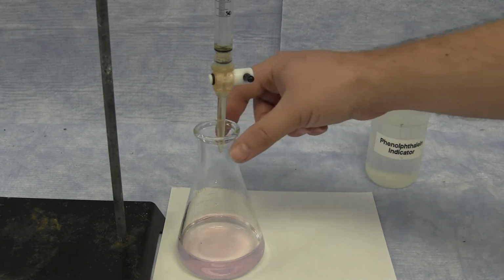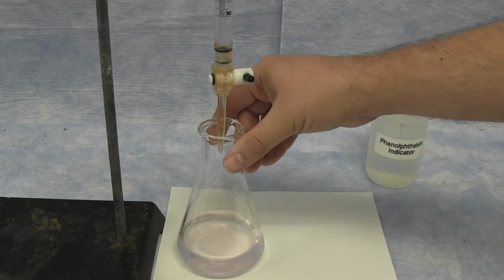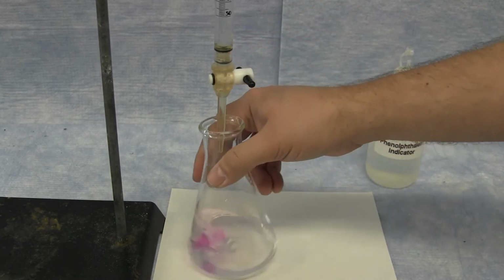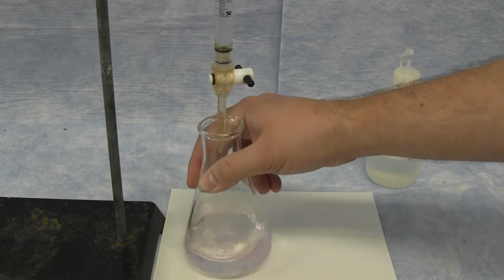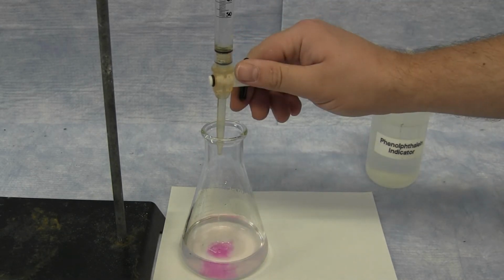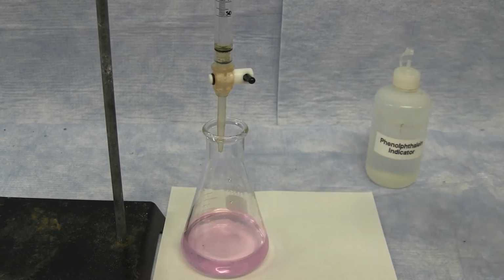Again, you want to aim for a very light pink color. This is the point where all of the sodium hydroxide has reacted with the potassium hydrogen phthalate, or with the acid in the flask. And now the additional base is causing the indicator to change to the pink color.